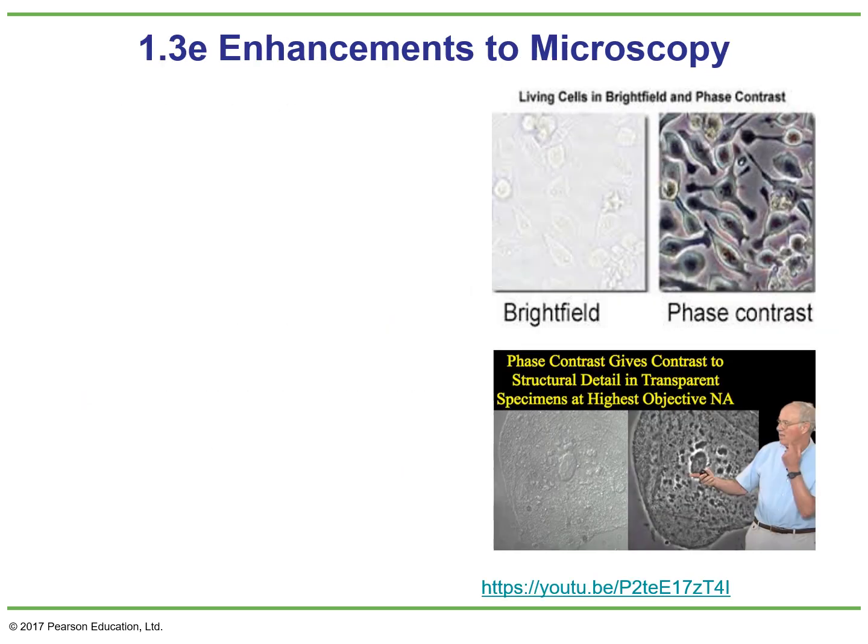Now I'm going to talk a little bit more about the phase contrast. Here again, bright field, amazing, has helped us a lot. However, there are times when you have living samples where this picture is much easier. If I ask you, please count the cells here, you say, Nicholas, this is too difficult, you will hate me. However, in phase contrast, life will be much easier, and you say, this is clearly a cell, this is clearly another cell, and here there is a piece of garbage, a debris of the cell, so maybe we shouldn't count that.